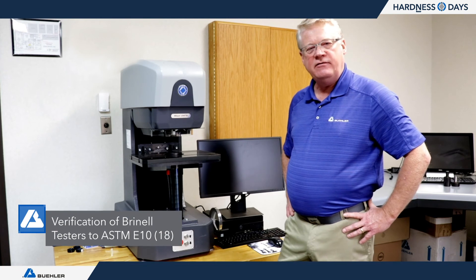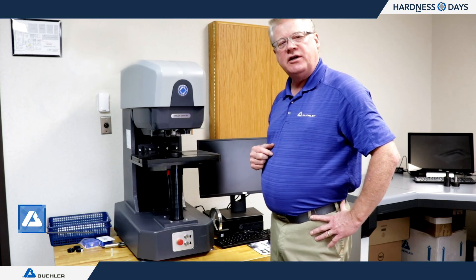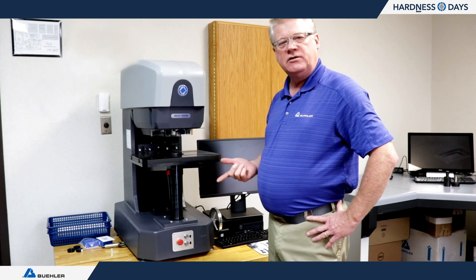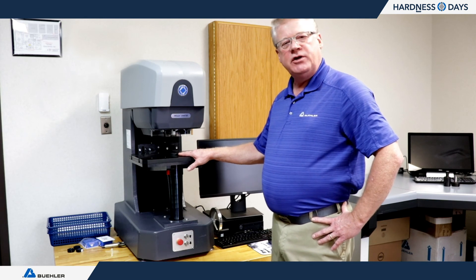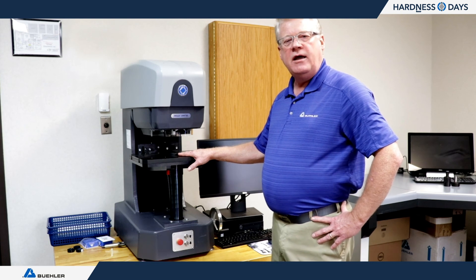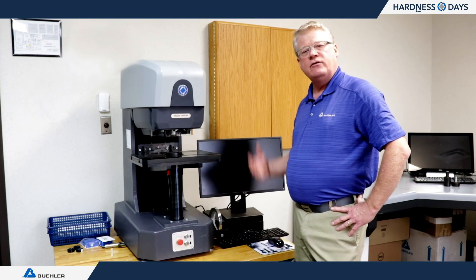The last standard we're covering today is ASTM E10 for Brinell hardness. This machine is a UH 4750 — a universal hardness tester that does Rockwell, Micro and Macro Vickers, as well as Brinell. For E10, we need to check the force and the measuring device. The technique is the same as with E18 and E92 for verifying that the camera measures correctly. And that's it for E10.